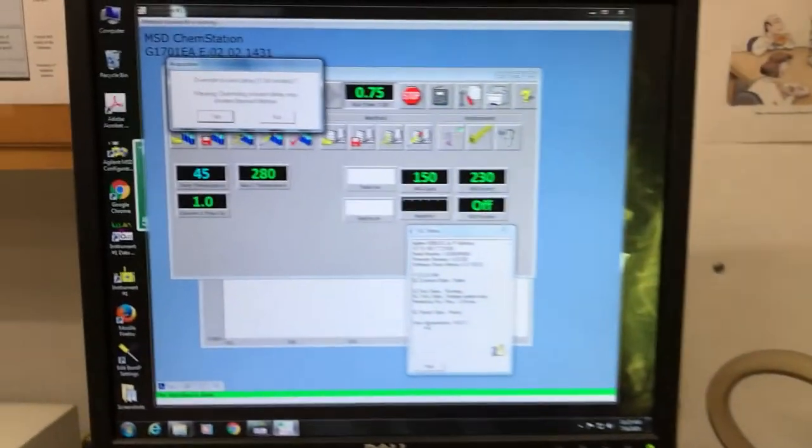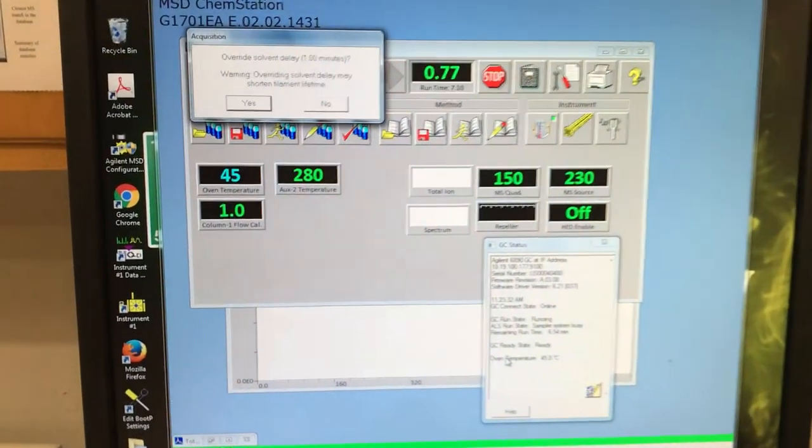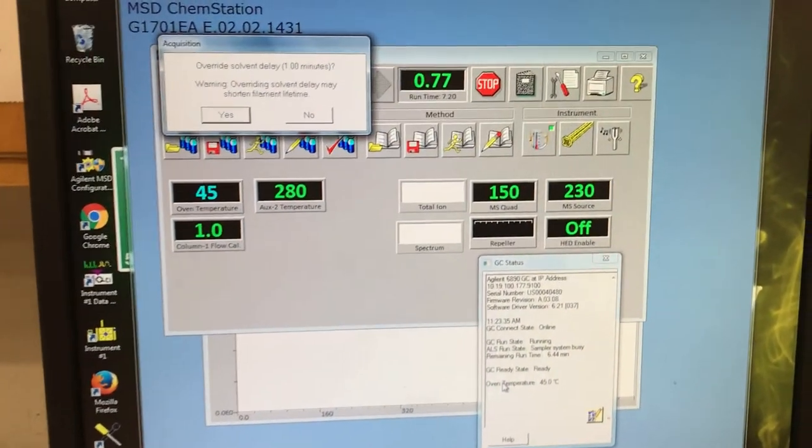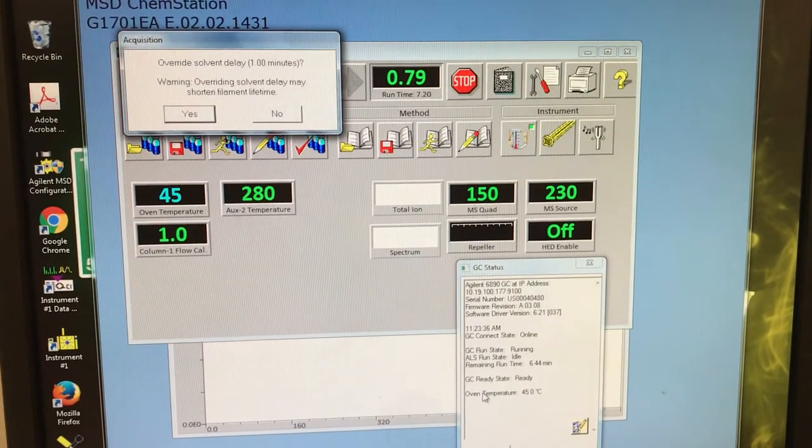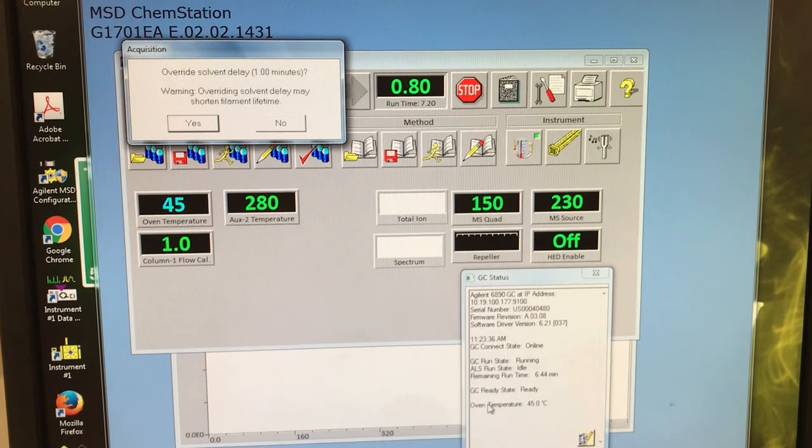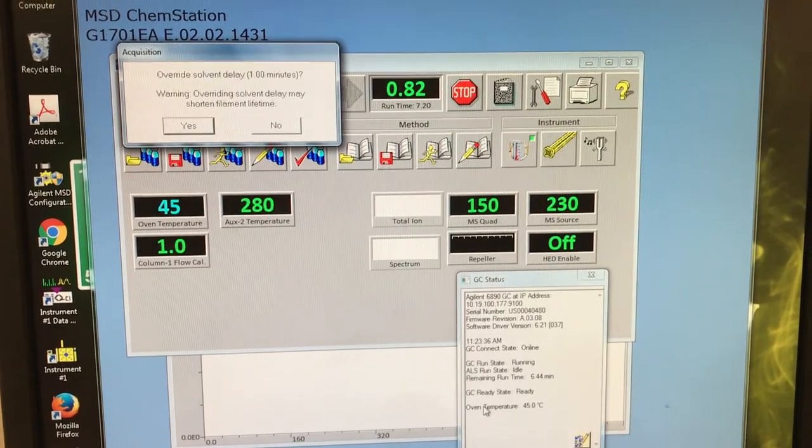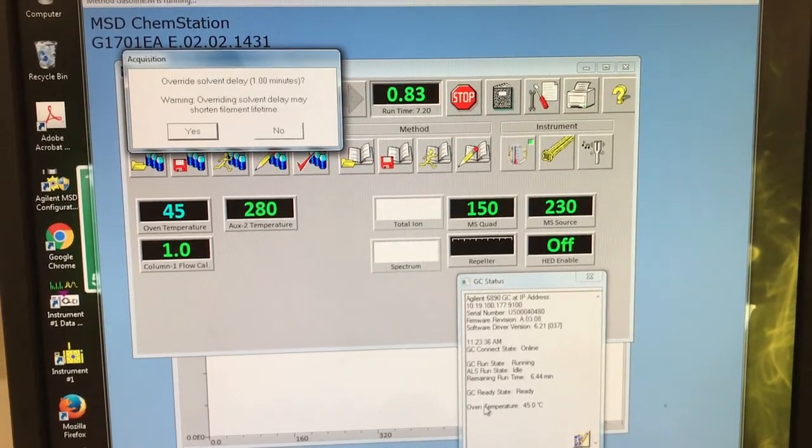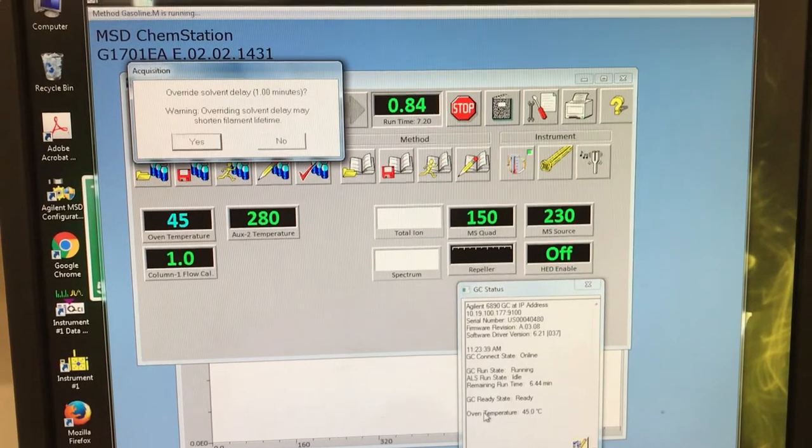Then on the computer you'll notice that the time is going up and it is running. At my college we have a mass spectrometer as our detector at the end of the GC and if you have one of those you'll get this comment that says override solvent delay and you want to do nothing. You can just ignore it and it'll go away or you could push no.